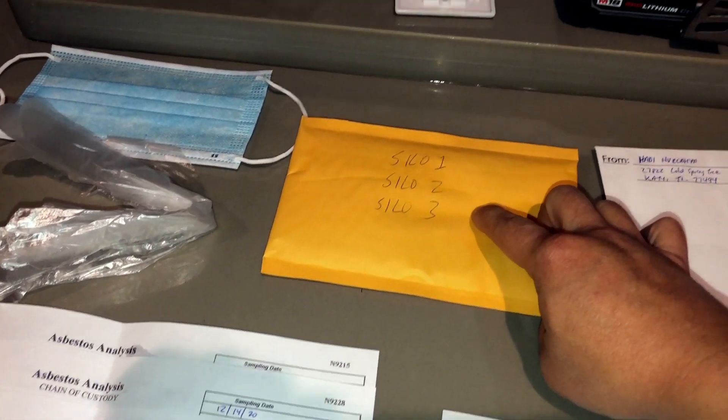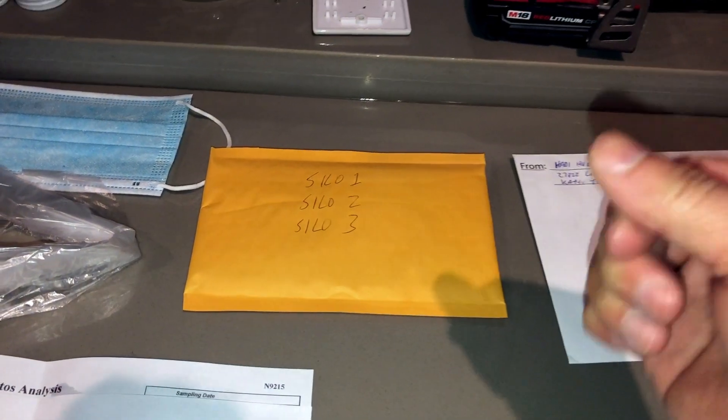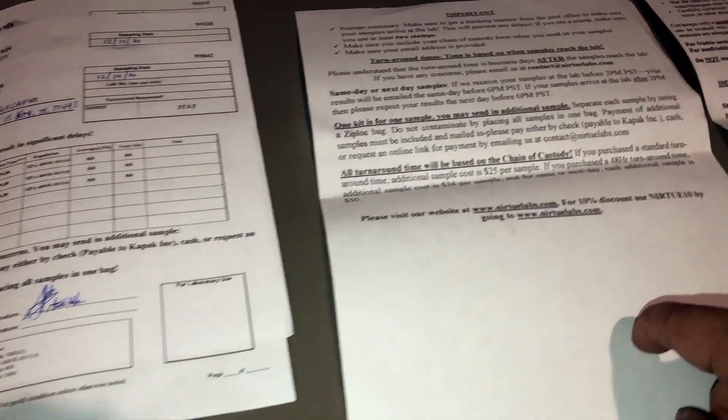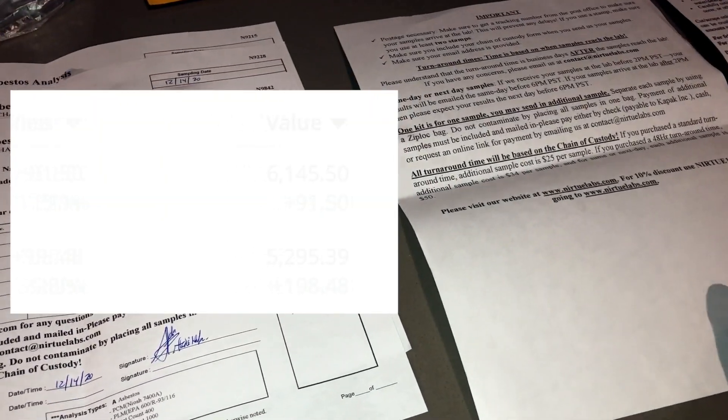Inside the kit it comes with one mask and a pair of gloves. This is a padded envelope — I've already put my samples inside in a Ziploc bag that they included. There's also a return envelope, an instructions page, a disclaimer page, and a form that you have to fill out.